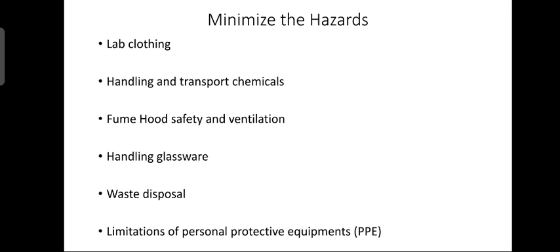Students should be able to explain the selection and proper use of emergency equipment such as fire extinguishers, eye wash stations, safety showers, spill kits, first aid kits, fire alarms and fire blankets. Students should know the importance of reporting laboratory incidents.